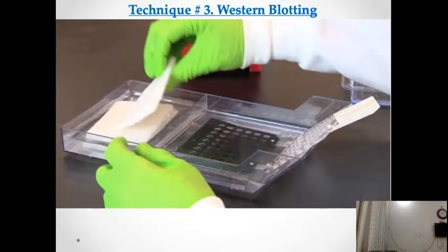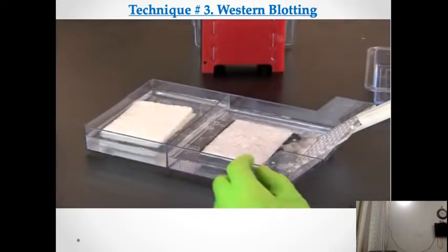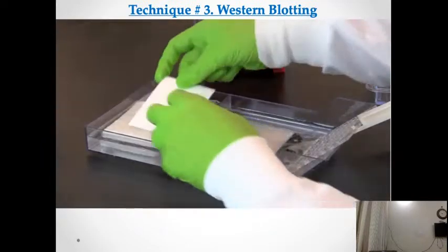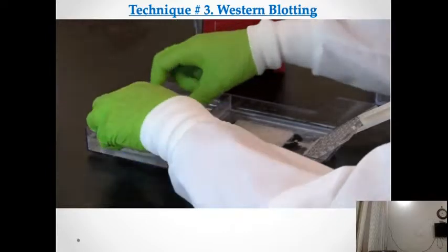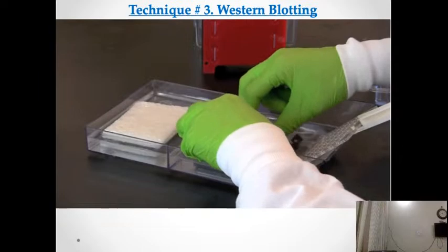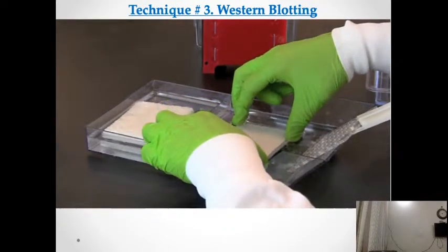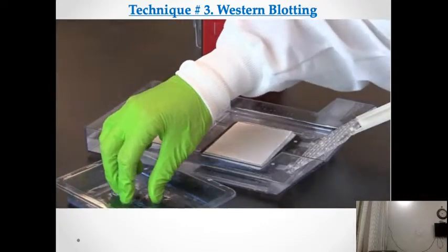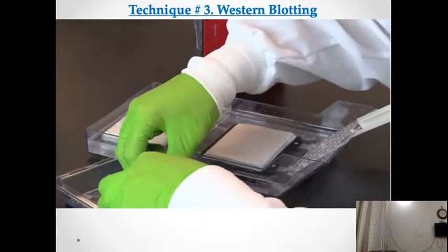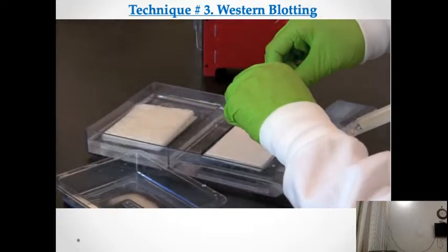Lay one fiber pad flat on the black plastic. Next, wet a piece of blotting paper and place it on top of the pad. Be careful to avoid any bubbles between the pad and the paper, and make certain the buffer covers the paper. Take the gel and carefully place it squarely onto the blotting paper, again being careful to avoid any bubbles between the gel and the blotting paper.